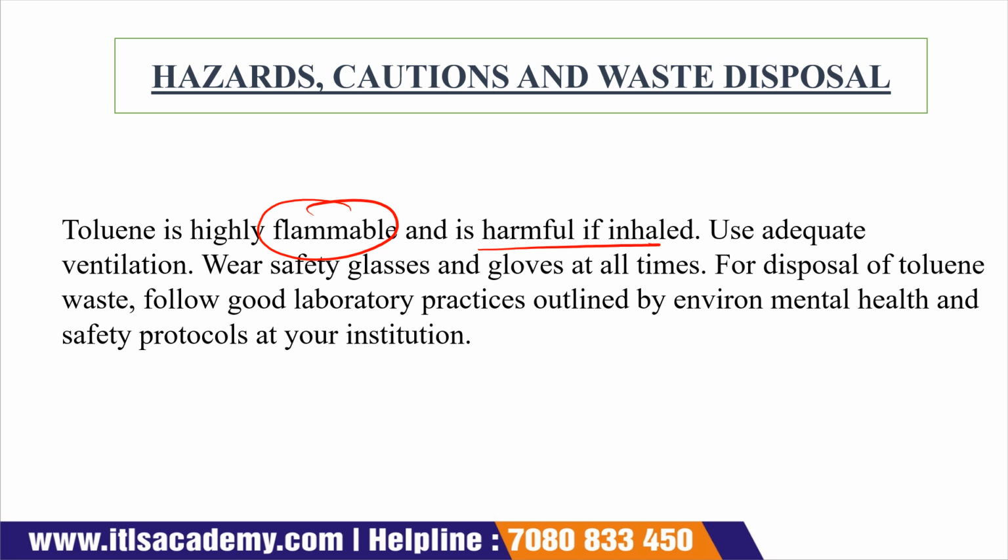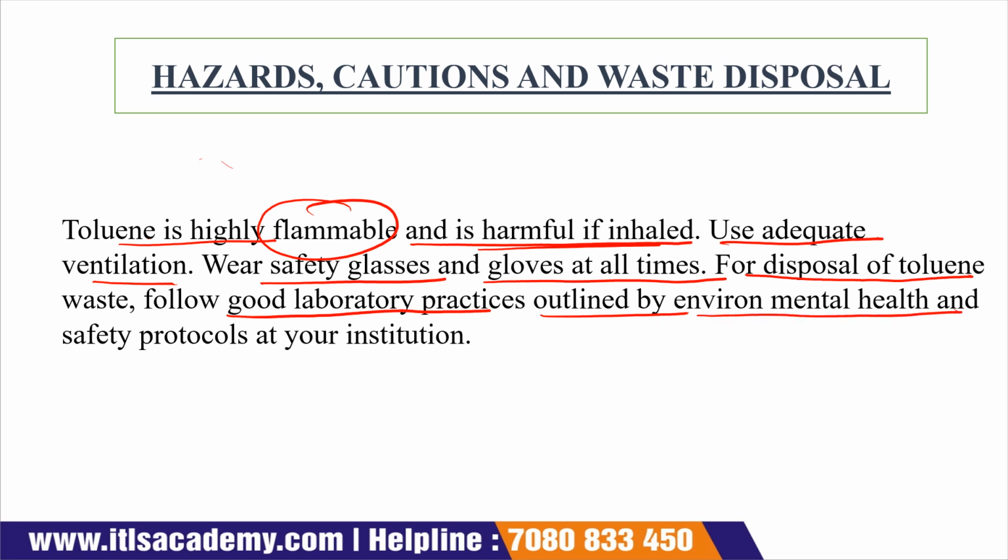Now see what is written in the slide. Toluene is highly flammable and is harmful if inhaled. Use adequate ventilation, wear safety glasses and gloves at all times. For disposal of toluene waste, follow good laboratory practices outlined by environmental health. So when we dispose of this toluene waste, we have to take care that the environment is not affected by this toluene, and we also have to follow the safety protocol given by our institute.